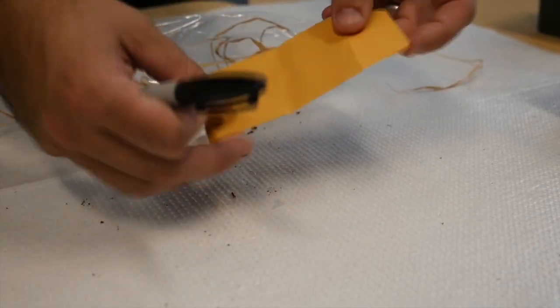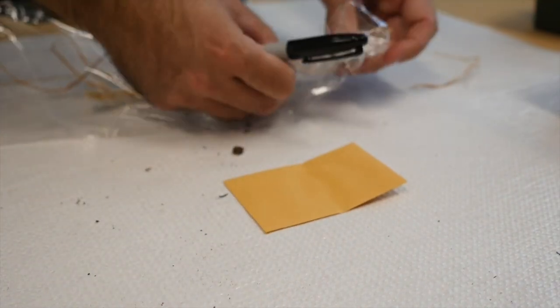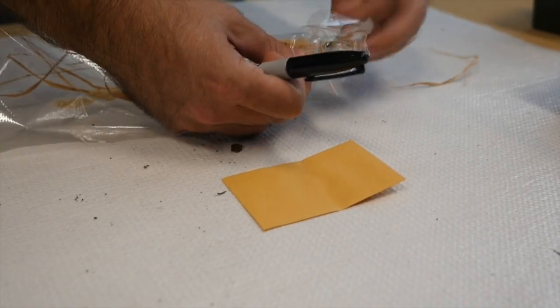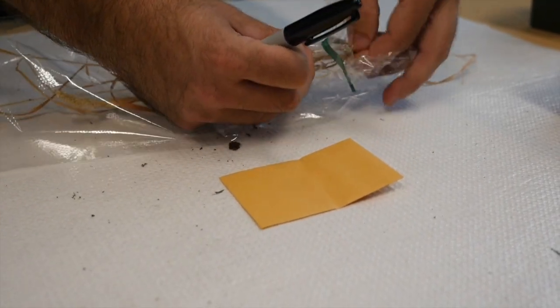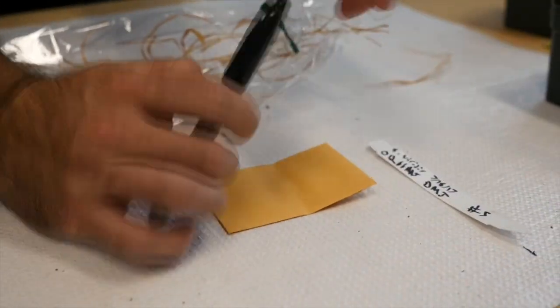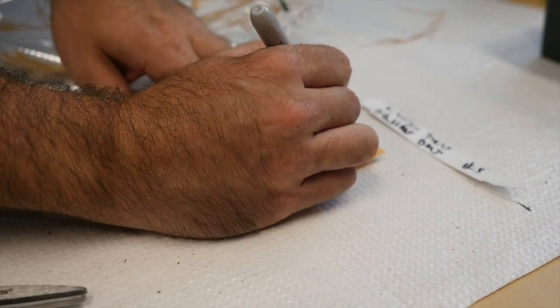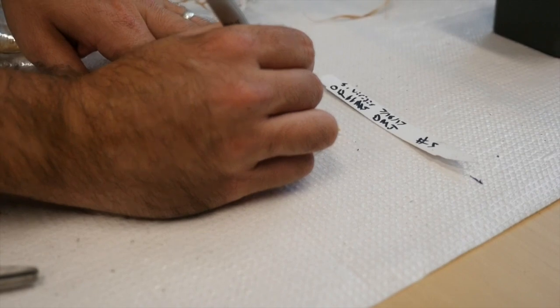So after you've collected your seeds into a clean coin envelope, what you want to do is grab the tag, lay it out, and then just transcribe all the information onto the coin envelope.